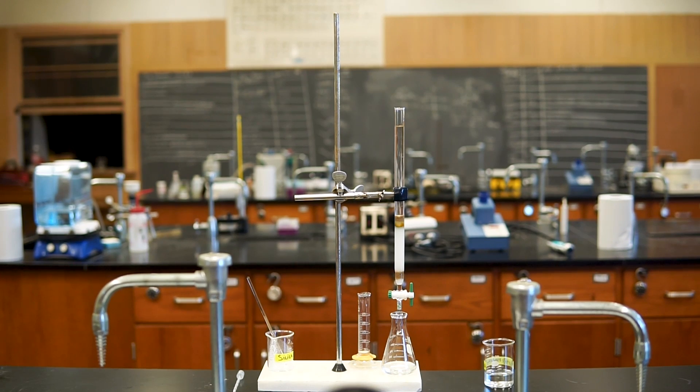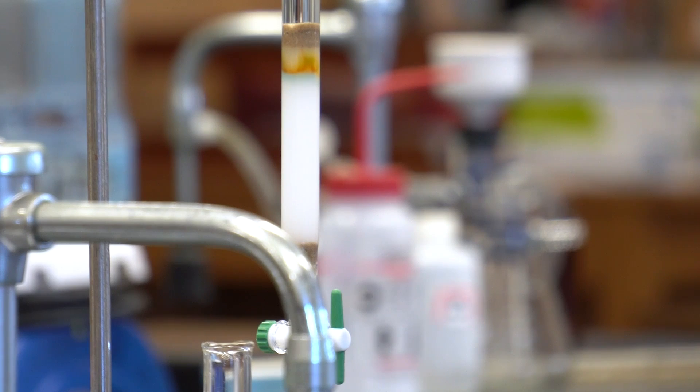When you open the stopcock the solvent level will start to go down. Remember that we can't let our column dry, so we have to add more solvent as the level goes down. We also want to be careful when adding more solvent, as we do not want to disturb the column. Add more before the level gets all the way down to the gel, and add carefully, letting it run down the sides. Continuing, we can see that our mixture is starting to separate into individual components.